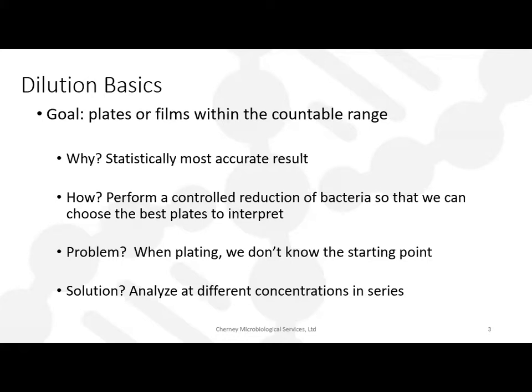So how do we go about doing that? We're going to perform a controlled reduction of bacteria so that we can choose the best plates to interpret that fit within that countable range. And we'll get into countable ranges a little bit later in the webinar.